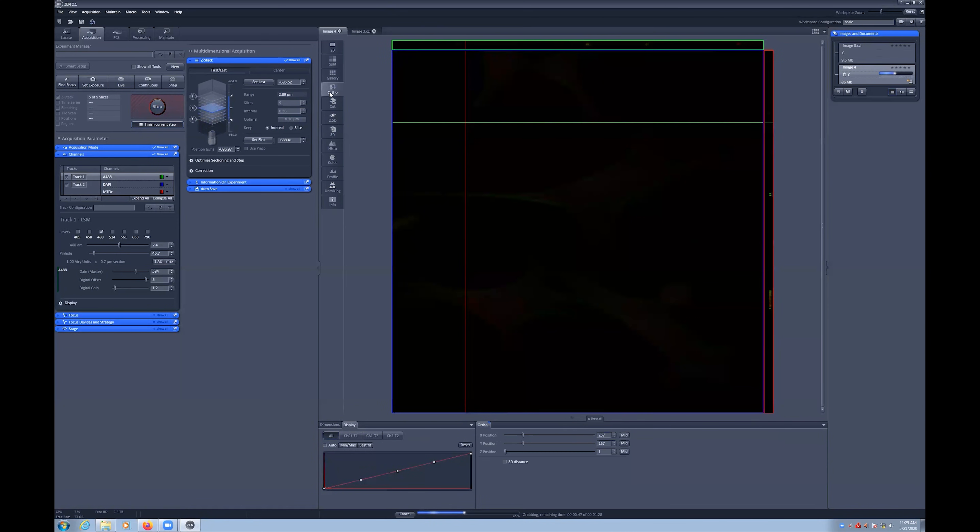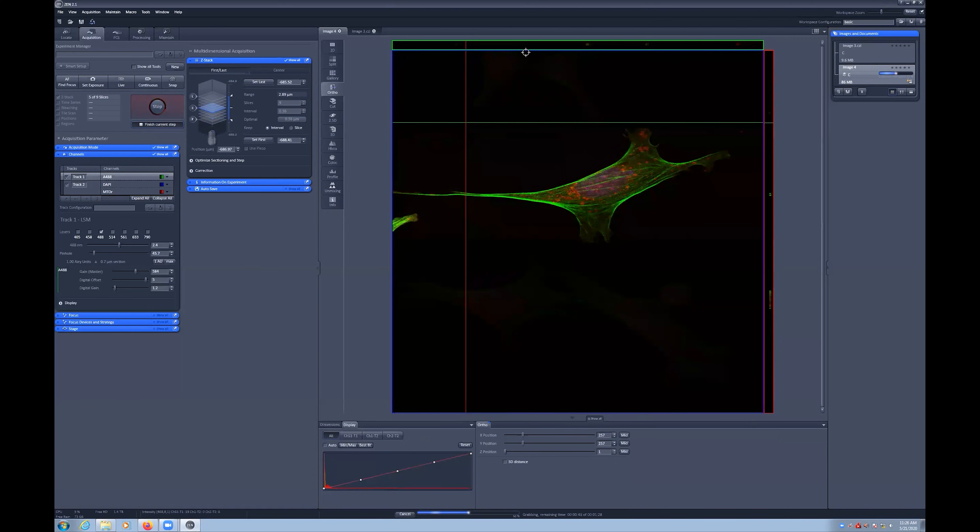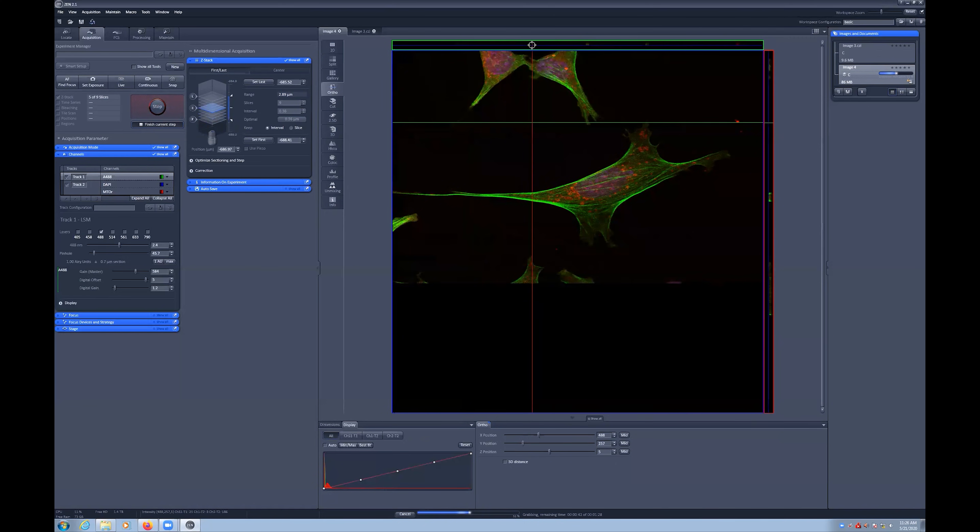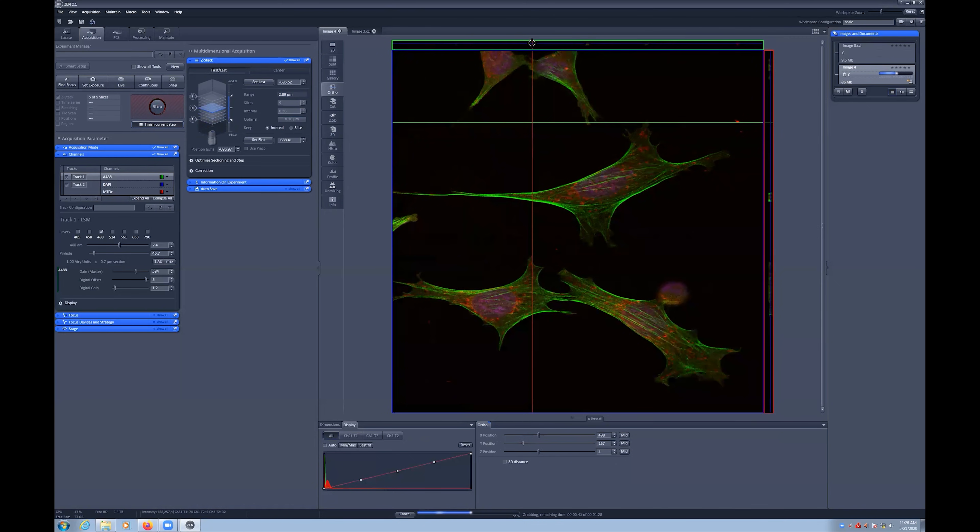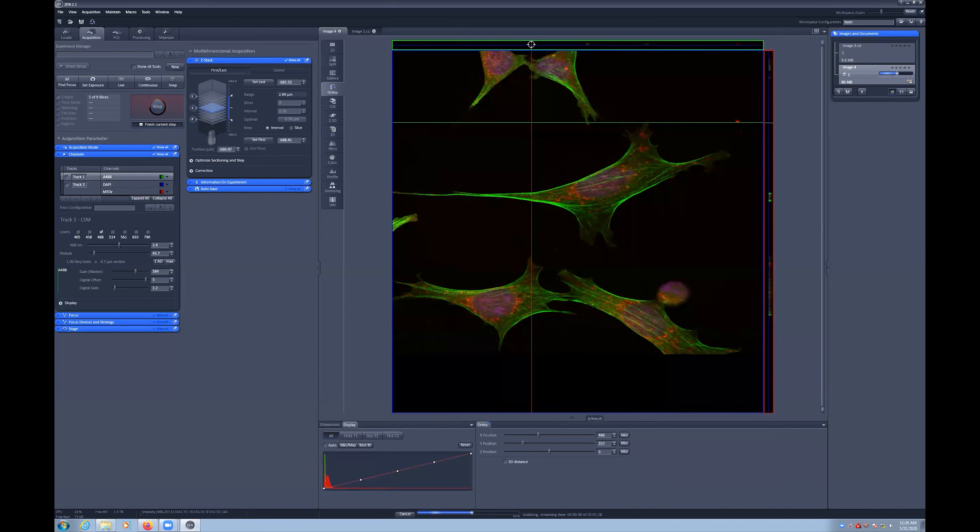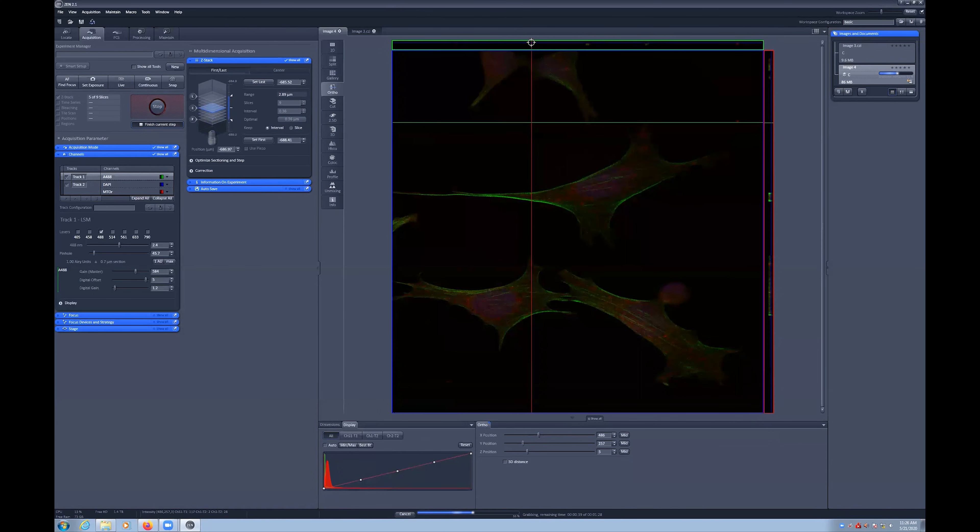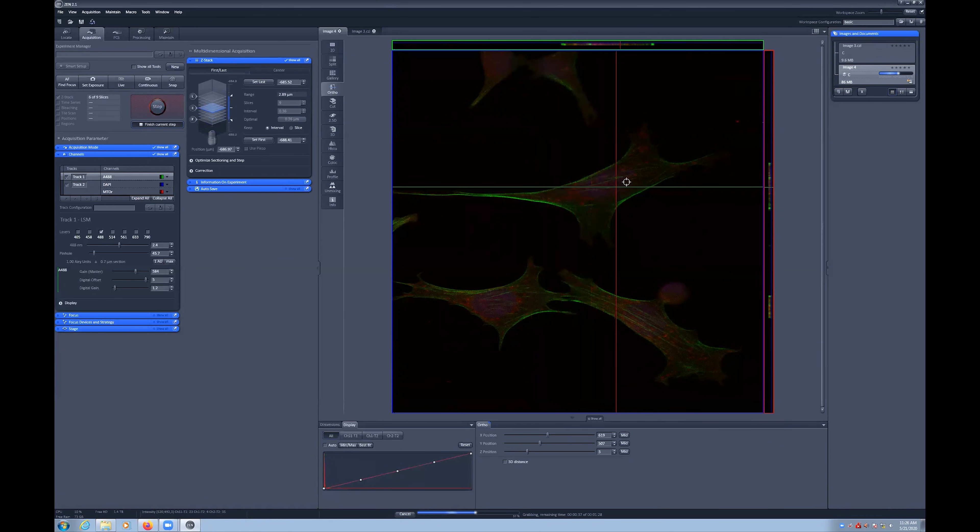There is also an Ortho view, which displays an orthogonal viewer to show the XY, XZ, and YZ images. These update by moving the lines.